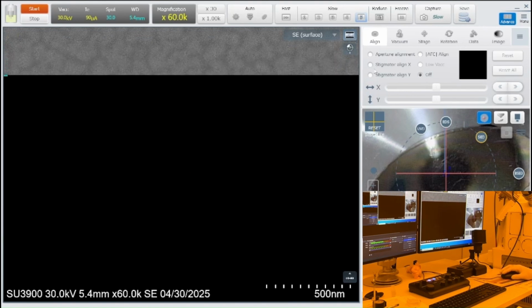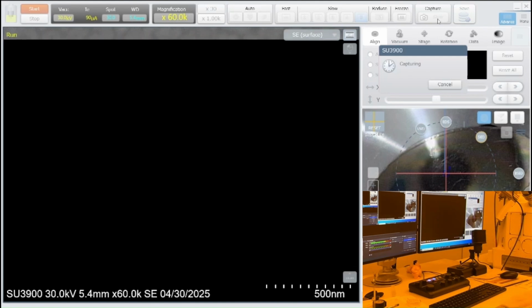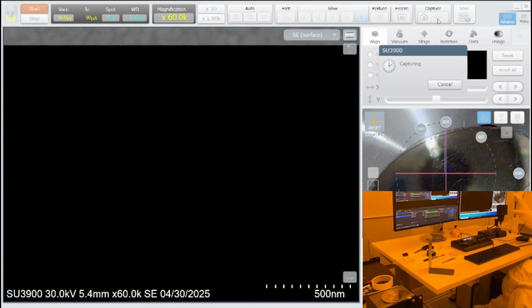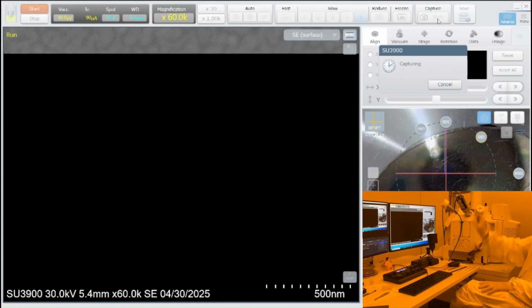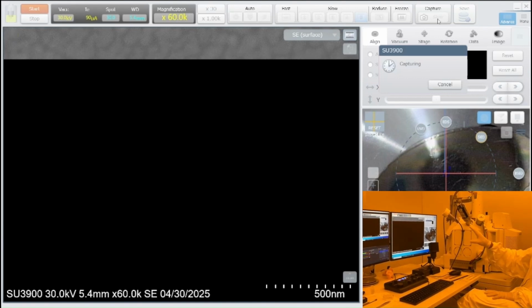Now, what sets the minimum working distance? On some of the other ones, maybe 3. No, like what is the one that sets right now? We're at 5.4. So when we measure our sample and then load it, if I want to get it closer to that height gauge, I can move it up or down 0.5 millimeter. So I could probably get this one about 0.5 millimeter closer, just when we do the sample exchange.